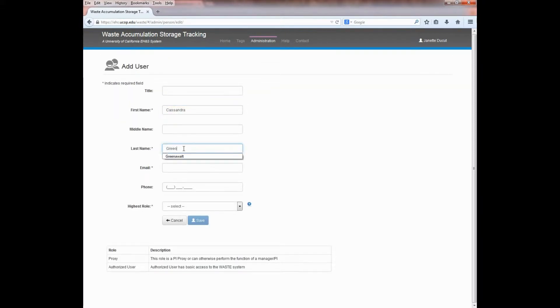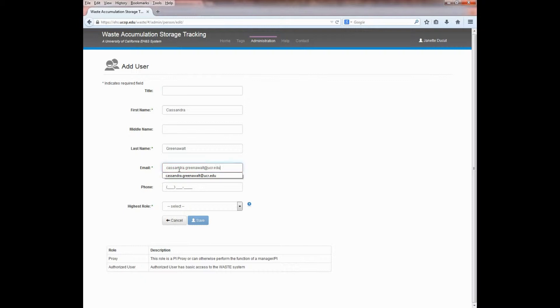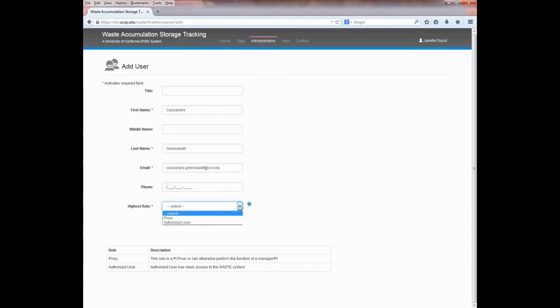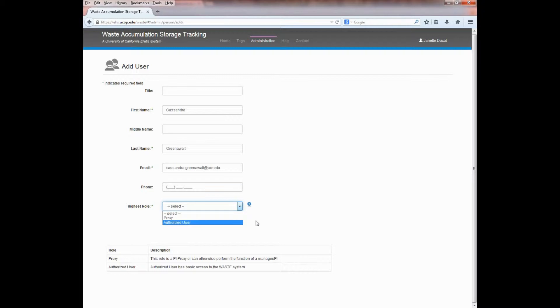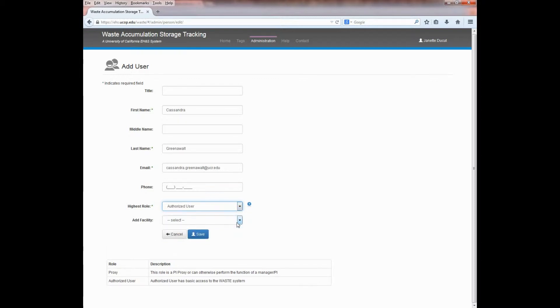Then enter a valid UC email address. Remember that the system will only allow users with a valid UC NetID. Thus, it's important that you enter their UC email address. Next, select the role that you would like the individual to have. A proxy can perform the functions of a supervisor or principal investigator, including adding users or locations, while an authorized user only has the ability to create tags or labels within an existing location. If you're not sure, select Authorized User. You can always change someone's role at a later date.